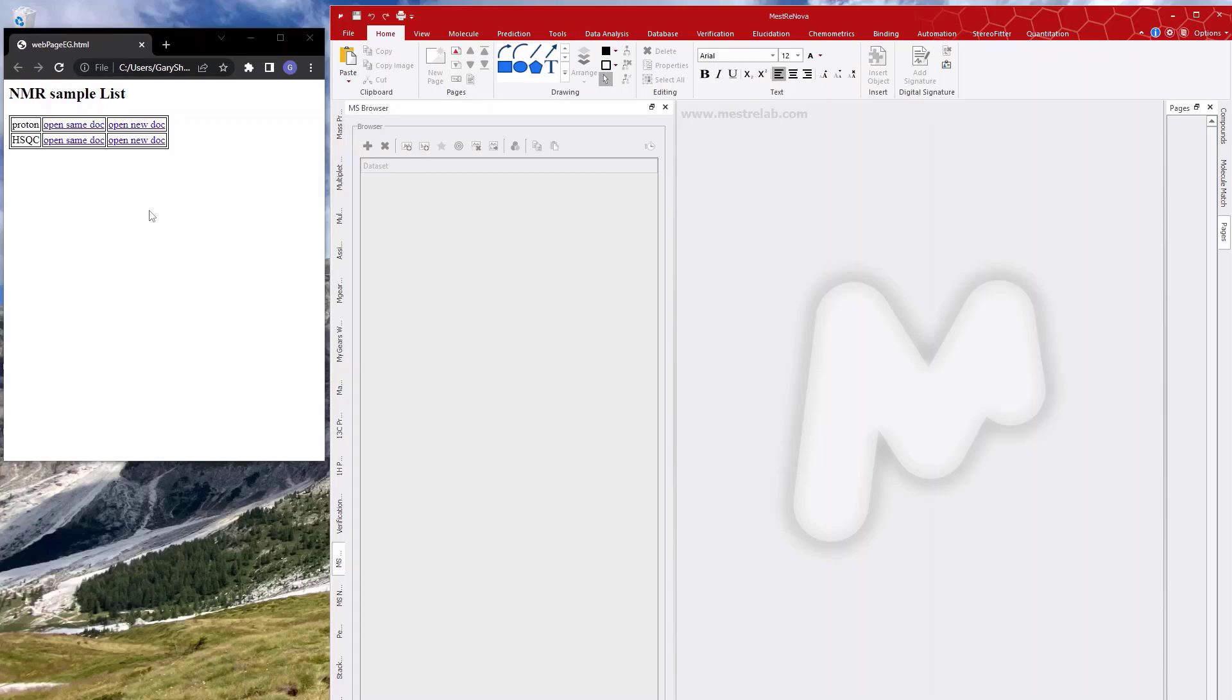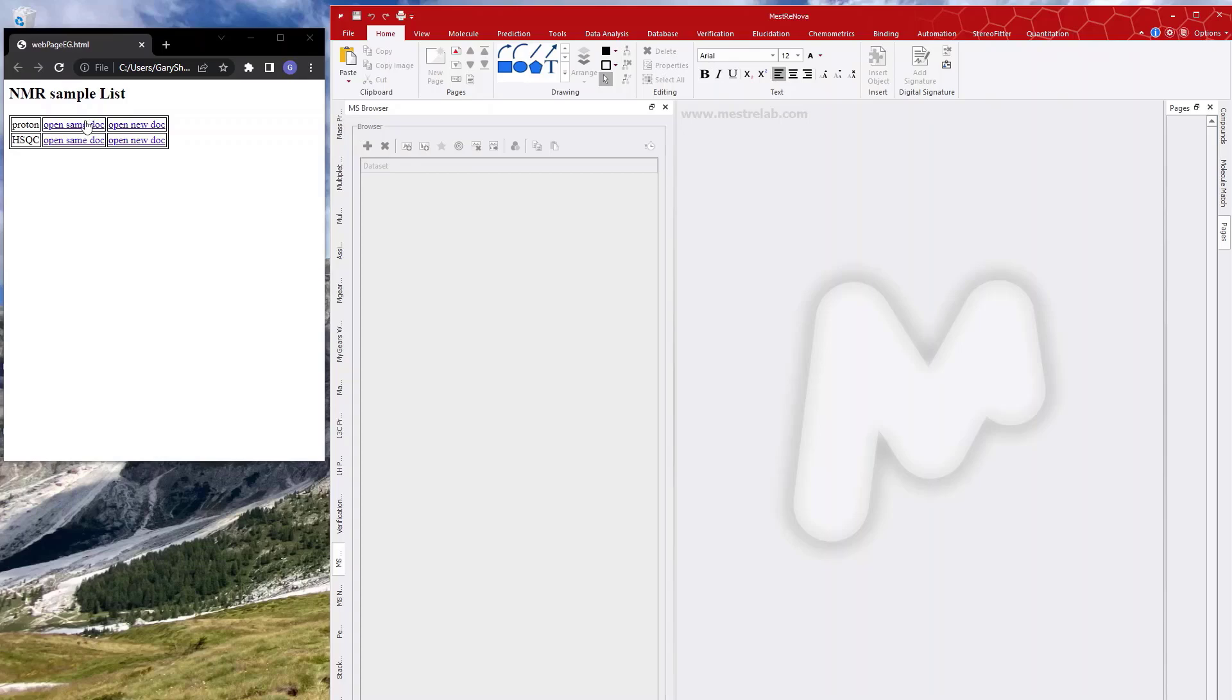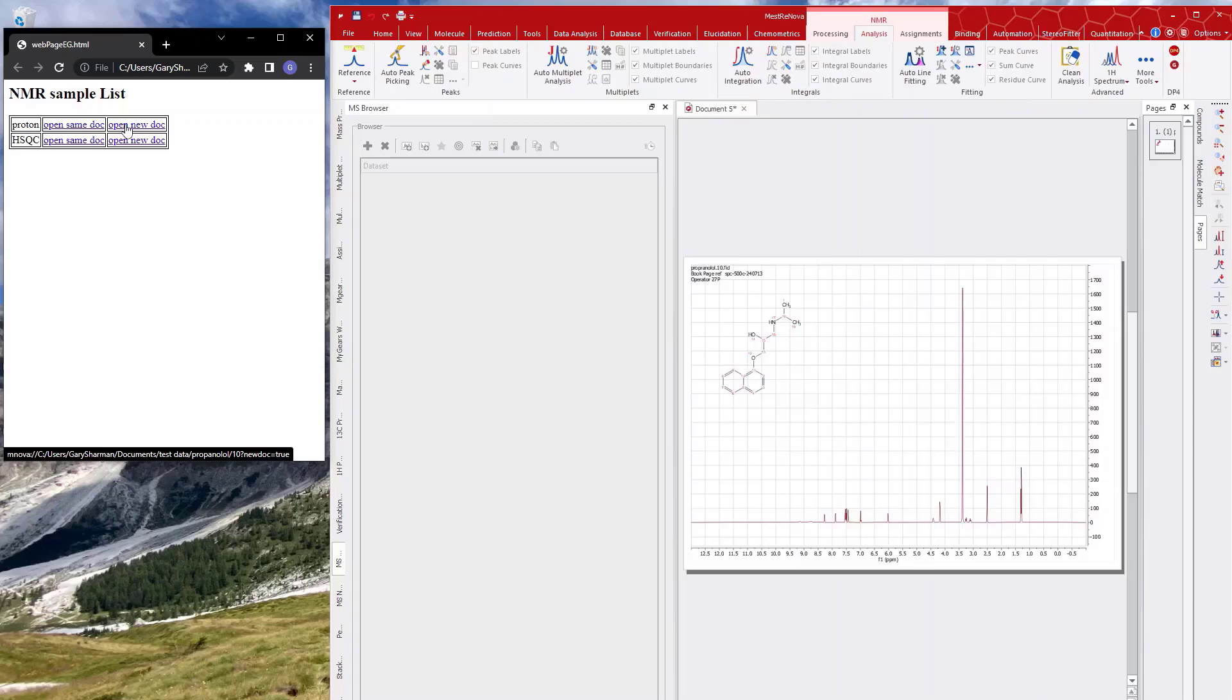So you see here I have a simple web page in Chrome that's got a table with Proton and HSQC in it, and I've got links to open it in the same or a different document. If I click on these, I can in fact do exactly what it says. So there I've opened the Proton.